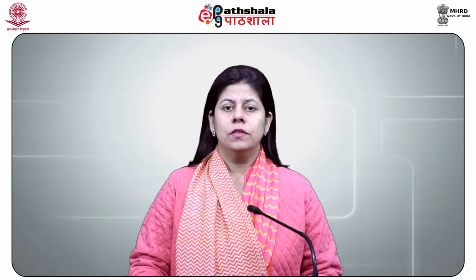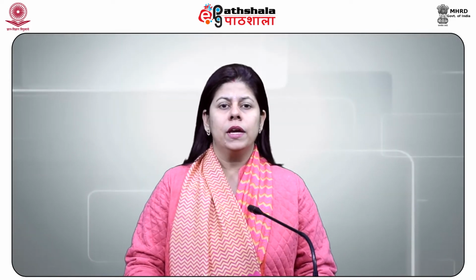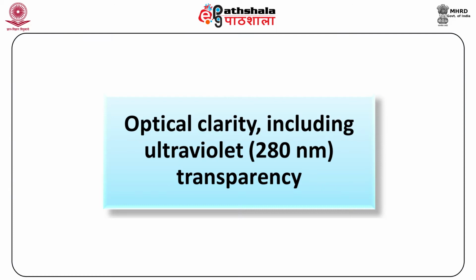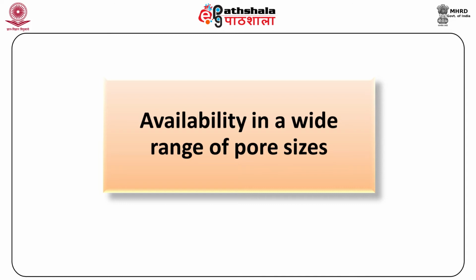Polyacrylamide gels. The most versatile of all matrices are the polyacrylamide gels. Their popularity is because of several fundamental properties. First, optical clarity, including ultraviolet transparency. Second, electrical neutrality due to the absence of charged groups. And third, availability in a wide range of pore sizes.